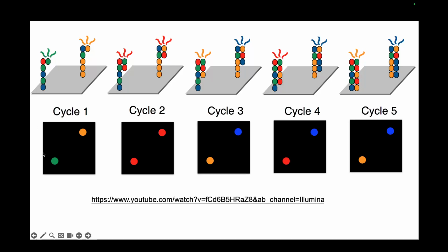After the sequencing machine takes a picture, the base caller can identify that the green has been added at the first position. That means at the first position, A has been added, and what is complementary to that? That is your original DNA sequence. Similarly, at the first position, yellow has been added. Yellow is a T, and if T has been added, what is complementary to T that is present in your sequence, which is going to be A.